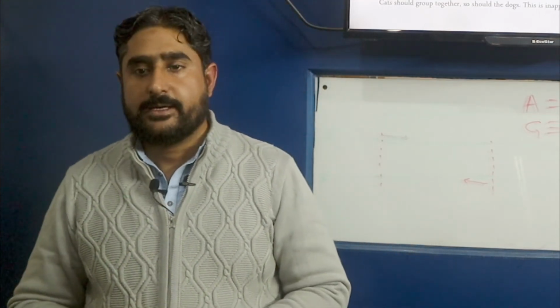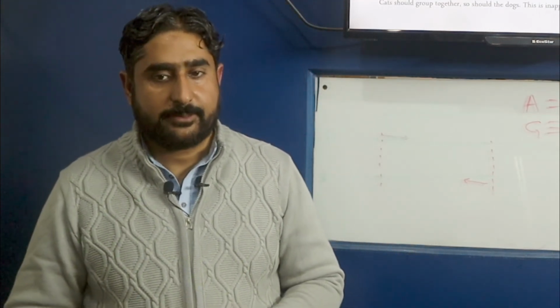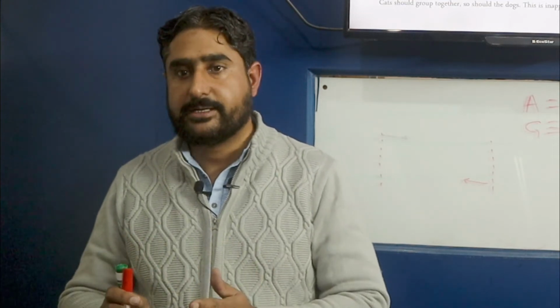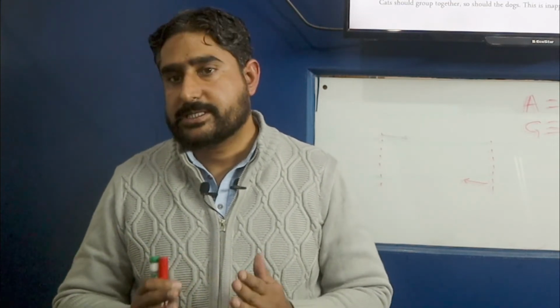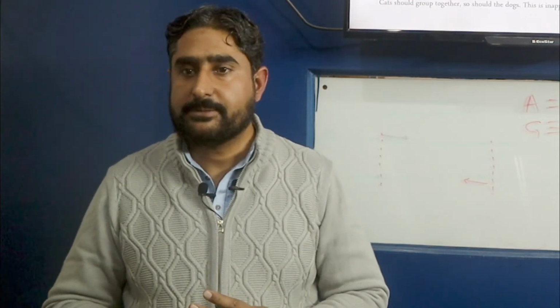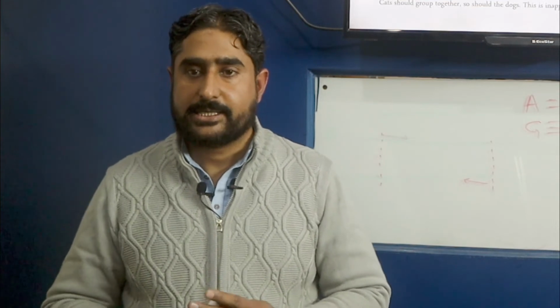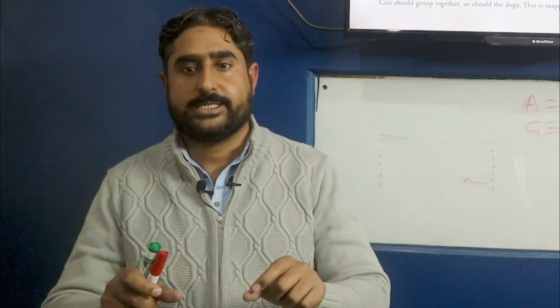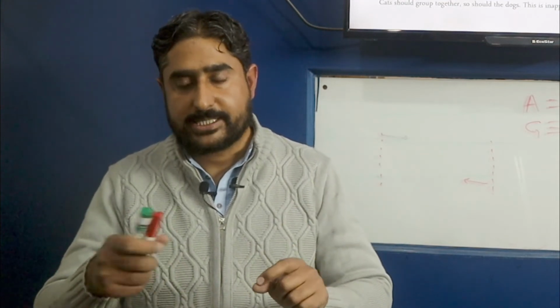Also, in picking up primers from the available literature, it's necessary to see what type of primers have been reported and what their objective or use was. We need to pick those primers which have been designed according to our own strategy, our own study. For example, if somebody is interested in deep phylogenetics, then he or she will need primers which are complementary to stable regions, which will amplify the stable regions.